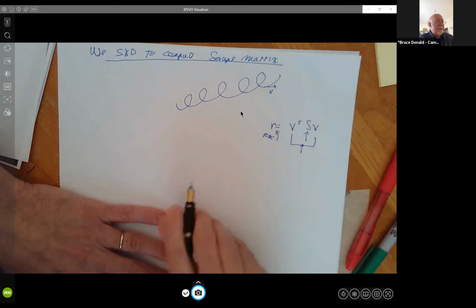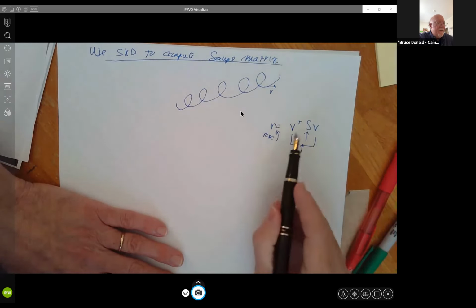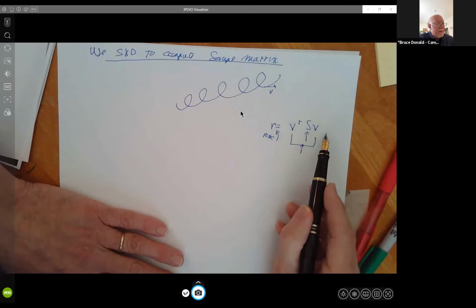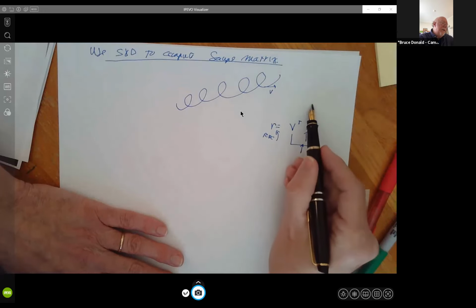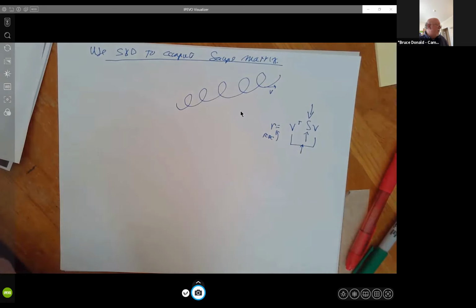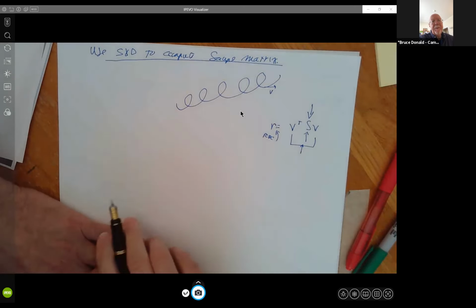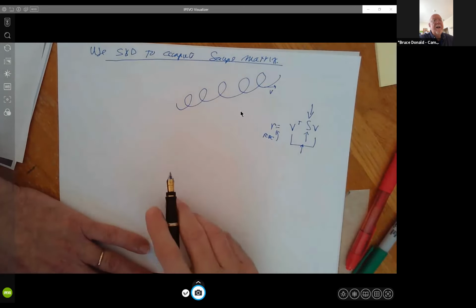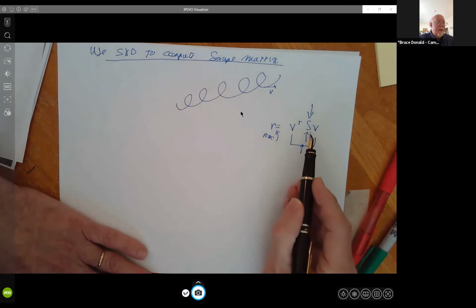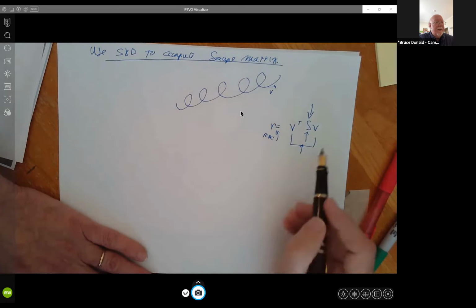So the thing to notice here is that the value you measure is quadratically sensitive to changes in the bond vector orientation. It's exquisitely sensitive to geometry changes, but it's only linearly dependent on the alignment tensor. So maybe I can fit something approximate. So the trick here that works pretty well is to say, well, I'm going to just assume I know it's a helix from other experiments. I don't know what the helix looks like. I'll just fit an ideal helix and use that to bootstrap my knowledge of the alignment tensor, because obviously you need both the alignment tensor and the measurements to solve for things. I mean, use the inverse problem.